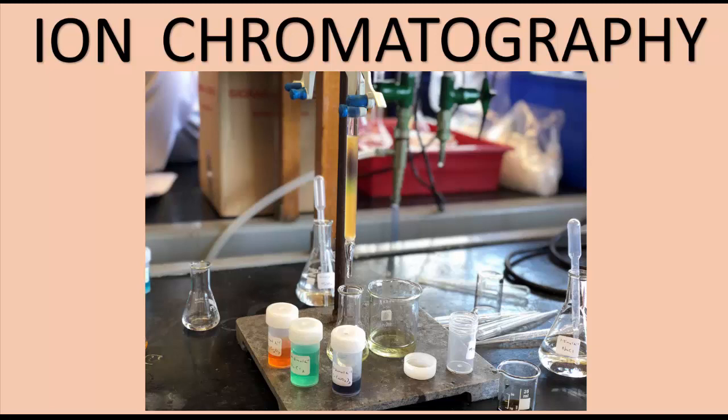Today's video is going to talk about chromatography. In particular, it's going to go into detail about how ion chromatography works. So chromatography in general, we are looking to separate the components of a mixture. When I say components, I mean different types of substances within that mixture.